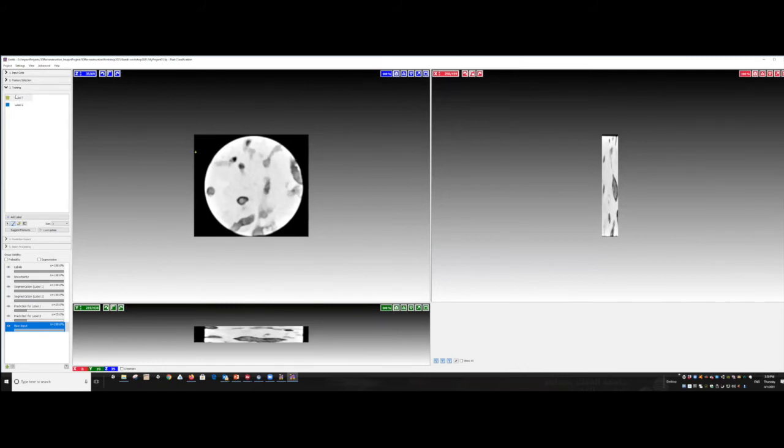And this is where the training happens. So label one, let's call this, if I double click on it, I can rename the label. Let's call this drop. And then label two will be the voids. And let's add another label to cover the outer layer. Let's just call it outside. If I had more materials, I can add another label and rename it, like water or gas, whatever it is. I'm just going to delete it because I don't want that label now.